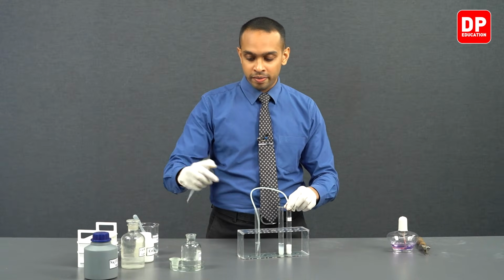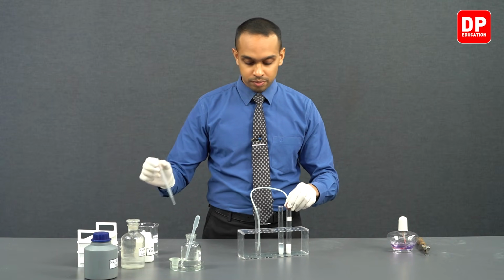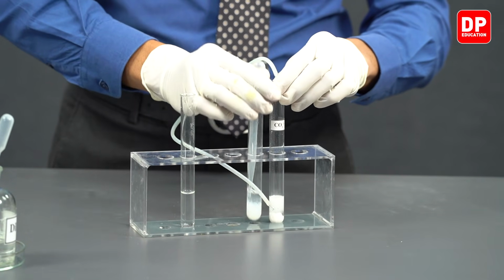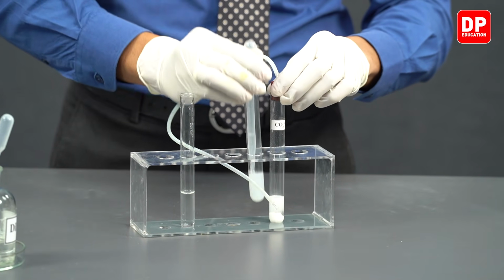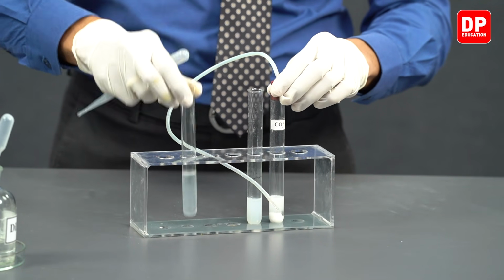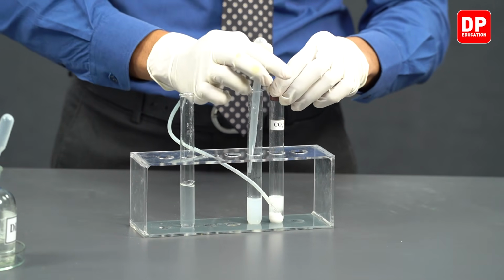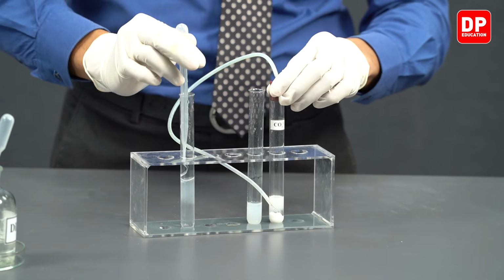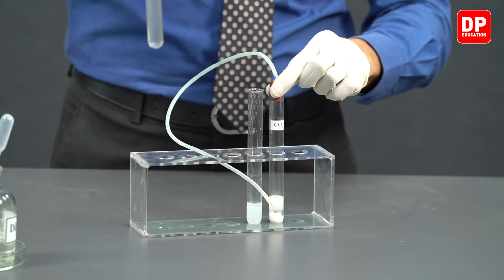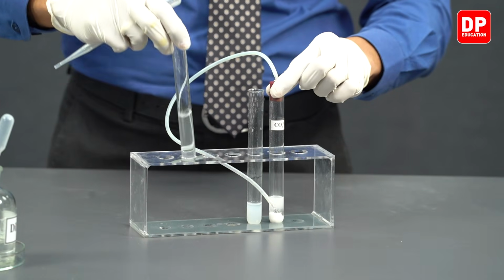So if you want to observe it one more time, we can take a dropper and add a small amount of this milky solution again into the solution over here, and you can see now the solution is a bit milky. And when you send the carbon dioxide through this milky solution, let's observe how it turns clear.